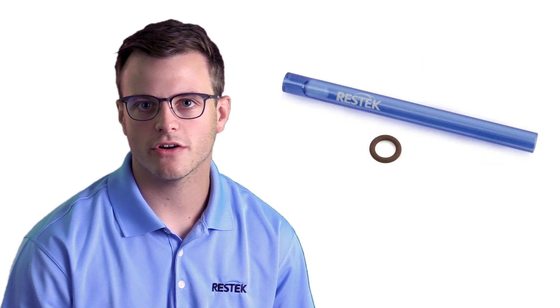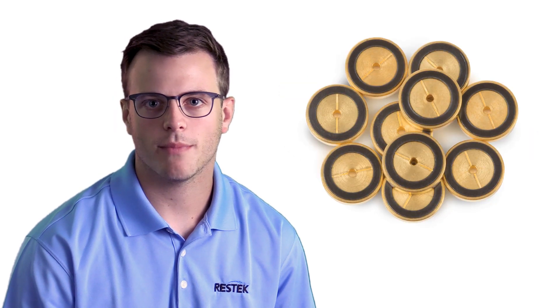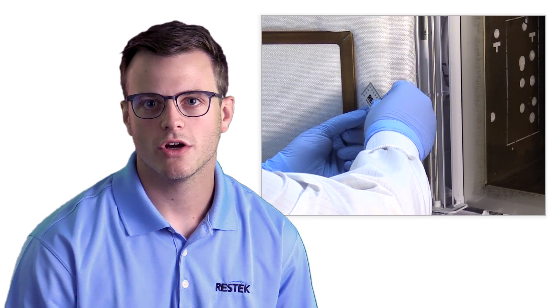Chances are you probably need to do some inlet maintenance which will help your chromatography bounce back. To do this we'll replace the septum, inlet liner and o-ring, inlet seal, and possibly cut a section of column to remove any residue buildup on the front end.